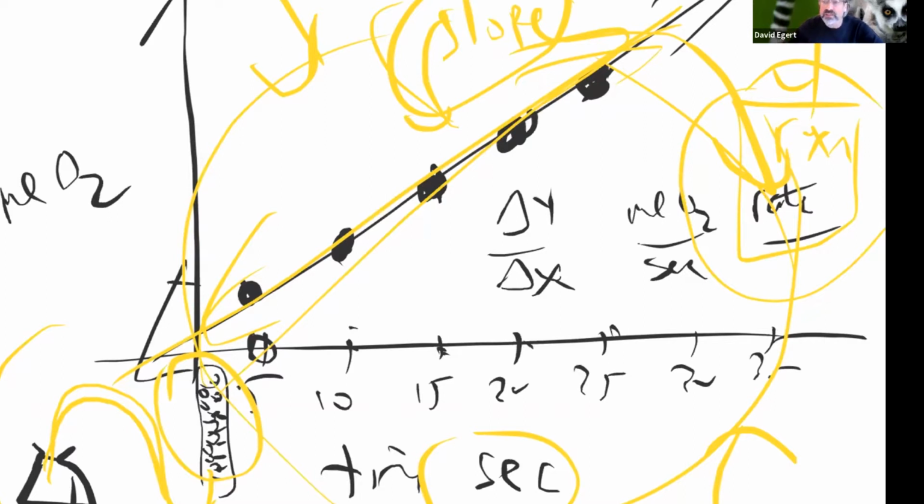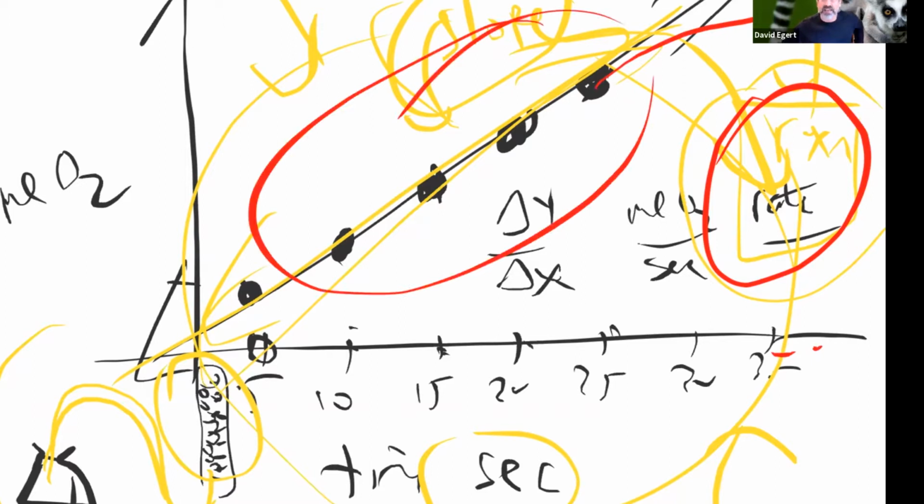Part of why this experiment tends to be confusing is that measuring the dependent variable, the reaction rate, is complicated. And there's more to it than what I've showed you here, because you have to start worrying about, as the reaction kind of poops out, this is not just a nice line. It starts going up, but then it's starting to die off.